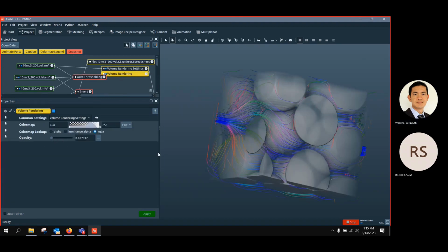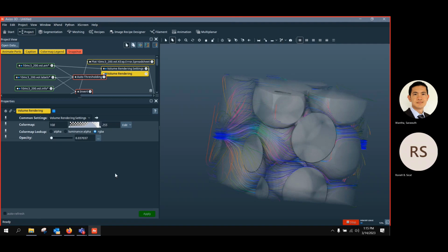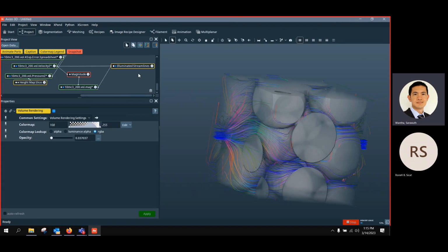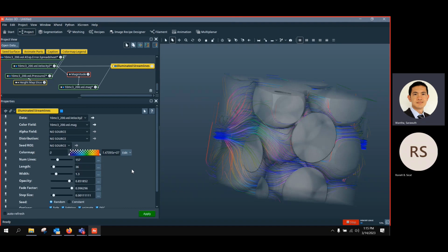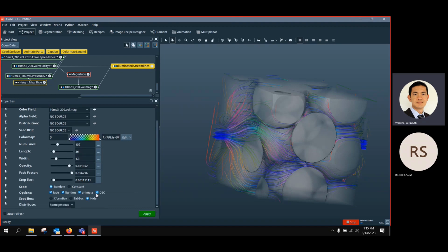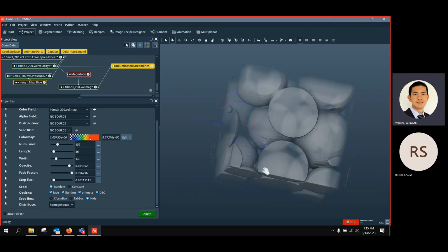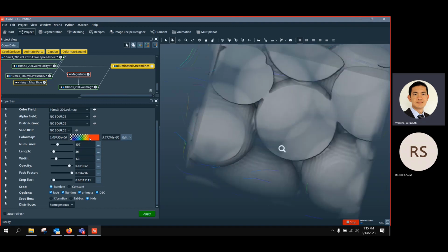We go a bit, yeah. Because I use the combination of the color map physics and then I use the DC, so it also doesn't give meaning because I just use the combination. Can apply. You can see that I don't use this DC option. They don't have this color. Yeah, it's just more to visualize, but the color doesn't correspond much to the property that I generated.